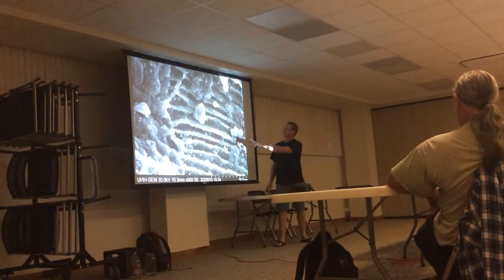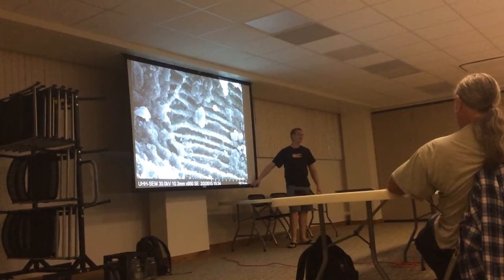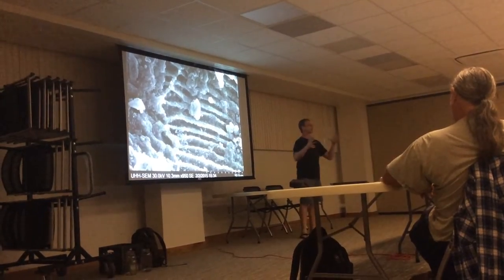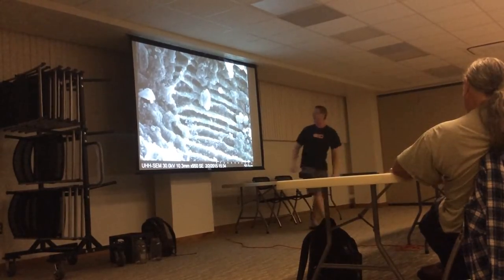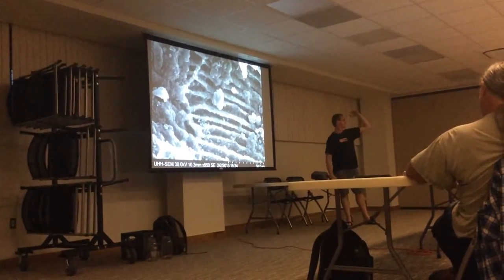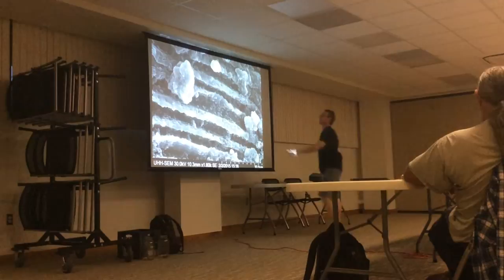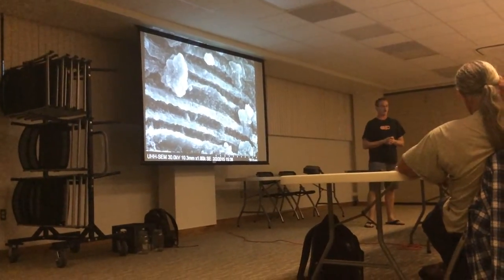So we're going into the grooves, and of course we're going to see now all of these little dots that are all up on the inside. Those are all going to be bacteria. So at 50 microns - to give people the best perspective - I like to think of it as a bacteria is a car, the size of a car, and 50 microns is about 25 stories. So if you're standing over something, you're about 25 stories up, and that's about the dimensions of a car, a human being being about half that size. So we're still way far away from these bacteria. This is covering a whole lot of surface area, and that's the key to having microorganisms in any compost - surface area. As we go deeper and deeper, you find that they exist in pretty much every nook and cranny. If it looks like it's chewed on or eroded out, that's basically what it is.